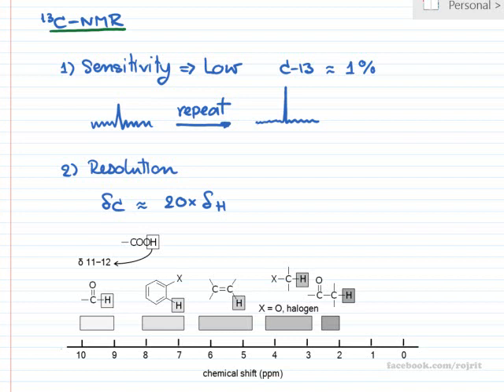So this is the carbon-13 NMR. Carbon-13 NMR is slightly different from proton NMR. First of all, the sensitivity of the carbon-13 NMR is very low compared with the proton NMR. Think about a methane molecule: almost 100% of the hydrogen atoms in methane are normal hydrogen, not deuterium, not tritium, right? Because the natural abundance of the simple hydrogen isotope, isotope 1, is about 99 point something.